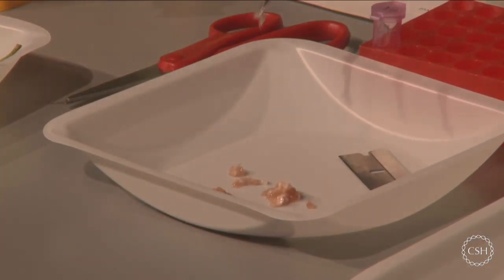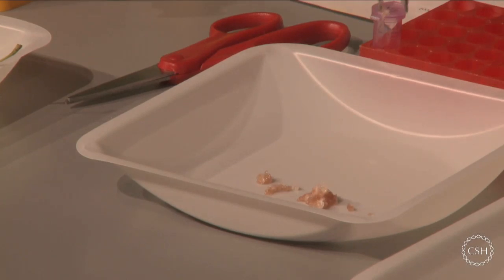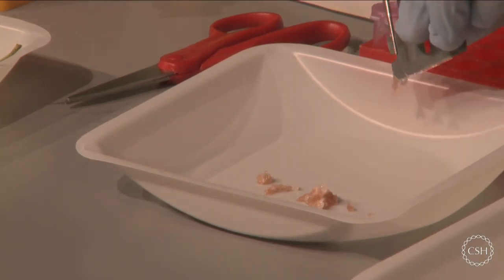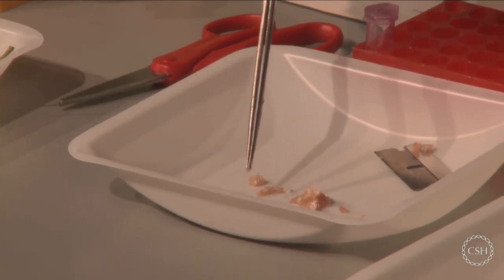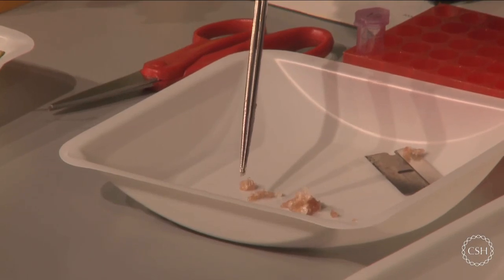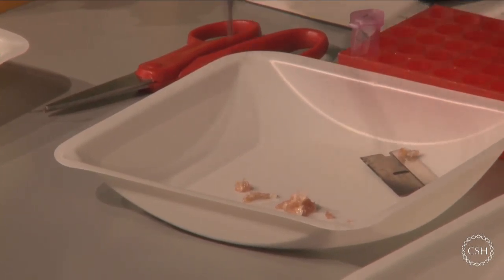So what I'm going to do is I'm just going to point here, and this is all that I physically want to work with here. It's just this little bit of section right there. So I'm going to clean off my forceps here, so I don't need all this stuff here. Right? So all I want is that piece right there. I don't want any more than that. Okay? Any more than that, I might have a problem.